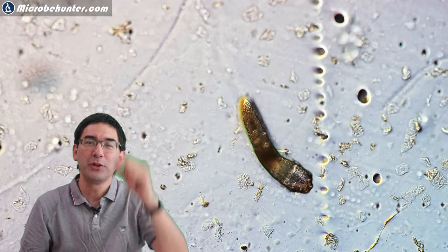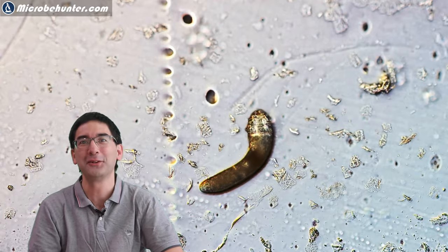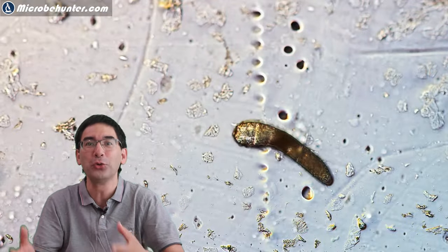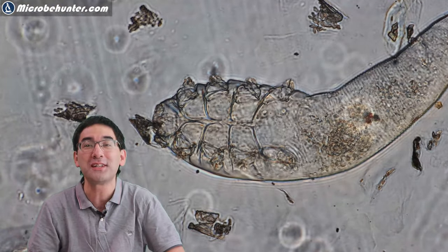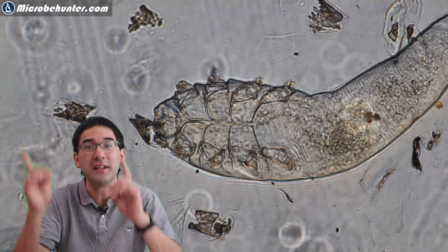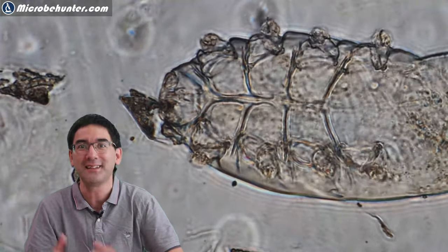This is a Demodex face mite which I got from the skin of my forehead. Hello and welcome, Microbe Hunter here. Maybe you have already seen my other video where I showed you how you can get those Demodex face mites out of your skin. If not, there is a link somewhere in the corner and also in the end titles.